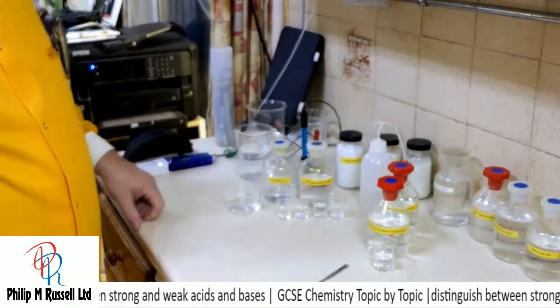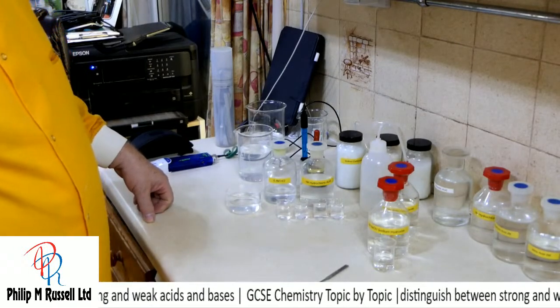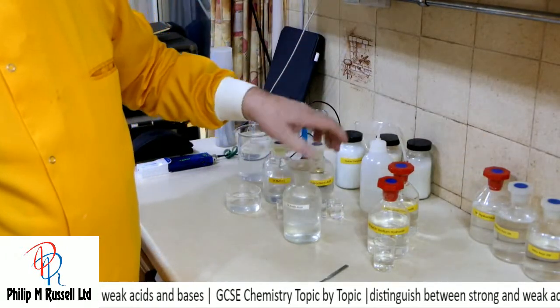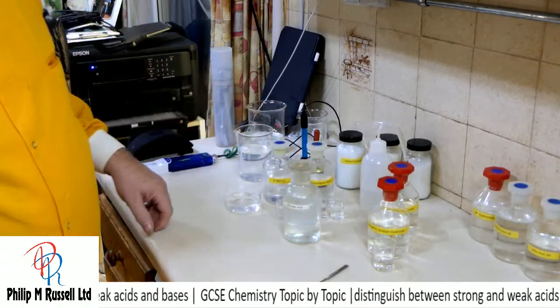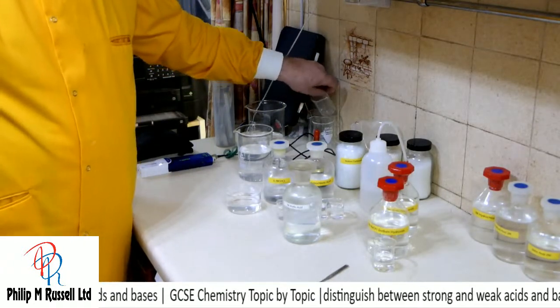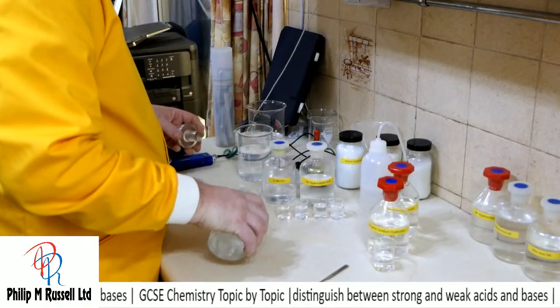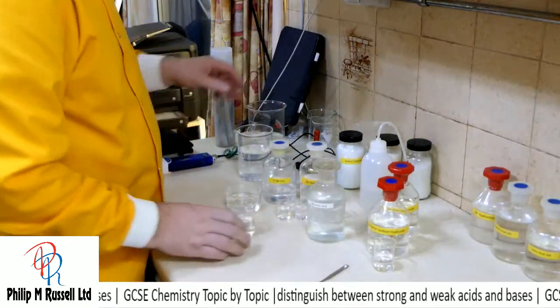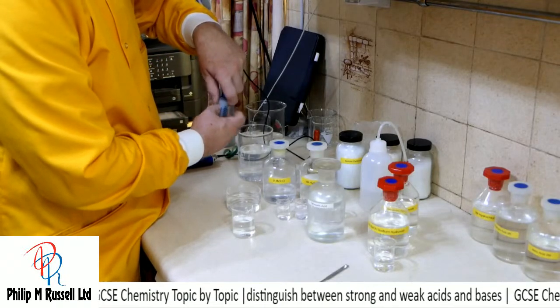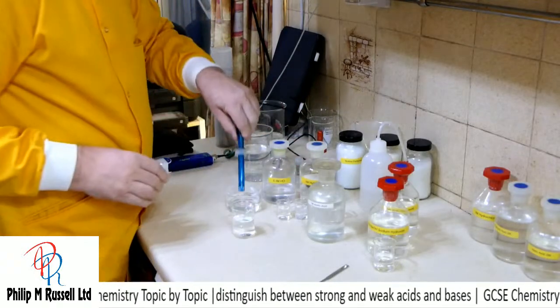So there we've had a look at some stronger acids, some weaker acids, and I suppose the only one we didn't look at was acetic acid for you to have a look at. I suppose I could be persuaded to do this one, having just put my pH probe back. I forgot it, so let's just do it quickly, because otherwise people will be wondering about it.